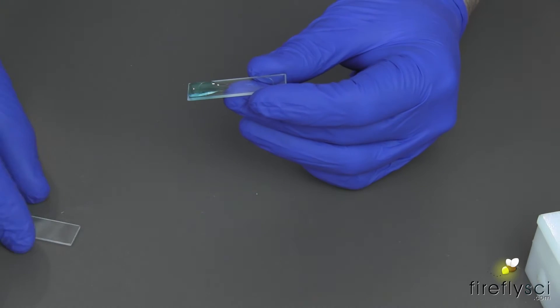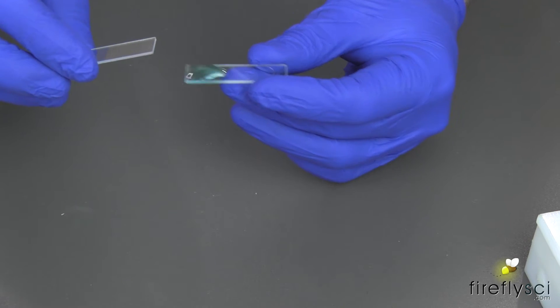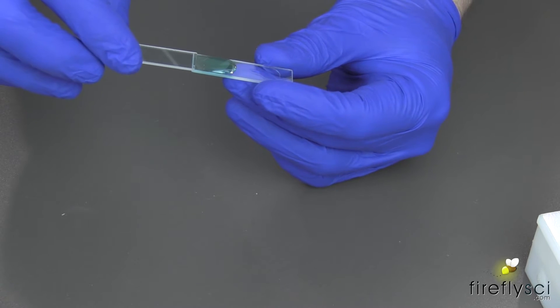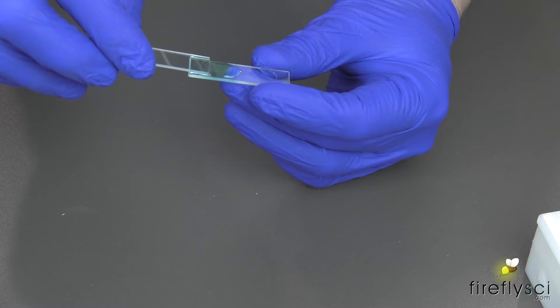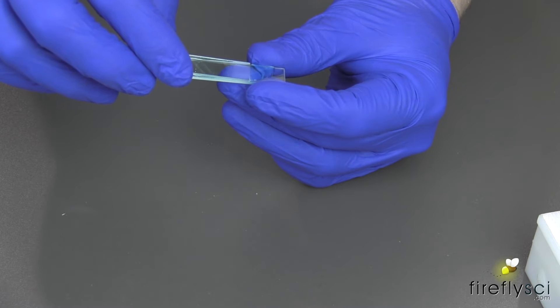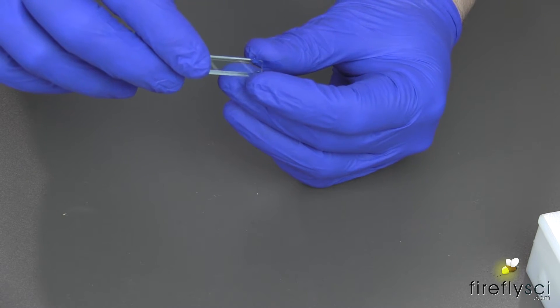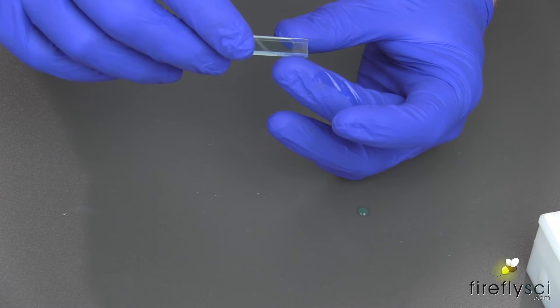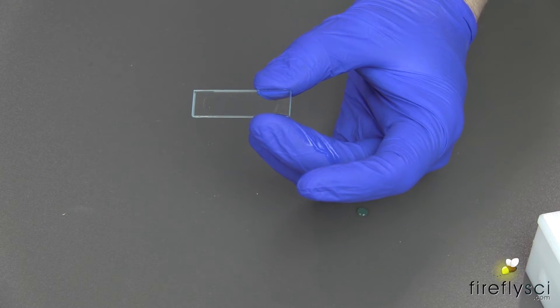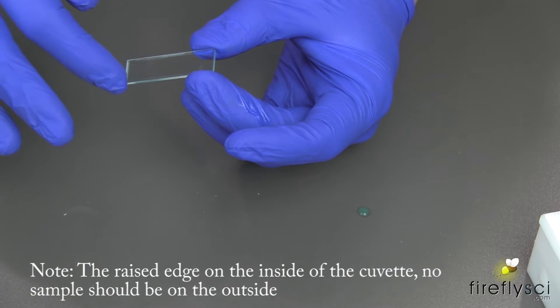To make the seal, I'll take the cover slip right here. Starting from the end where I put the drop, I'll gently slide this cover plate over the cell and make sure there are no air bubbles. If you do see air bubbles, back the cover plate up and put a drop of sample on the cuvette and continue to slide the cover plate until it's completely closed. It's important that the raised edges are wet here, and this is what keeps the two plates sealed together.